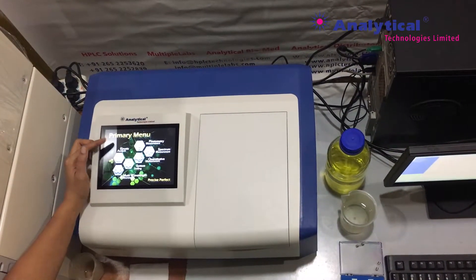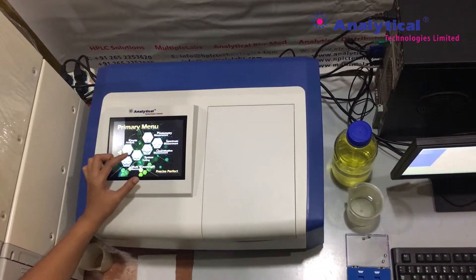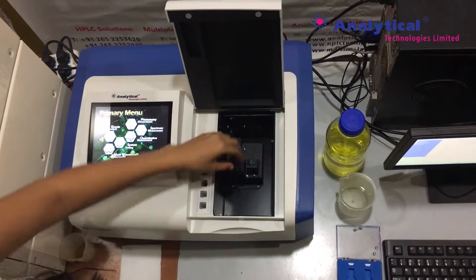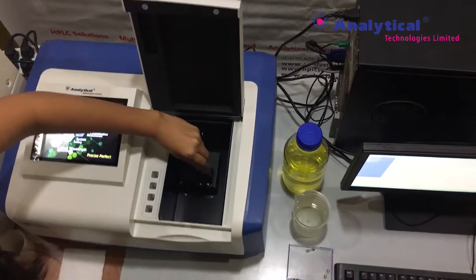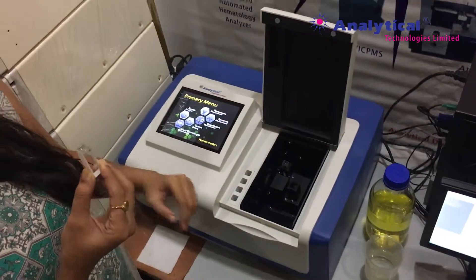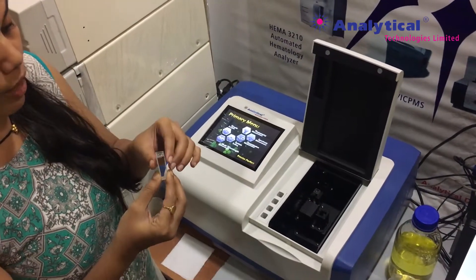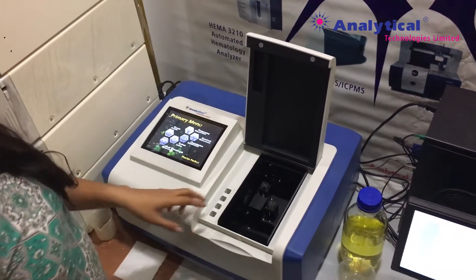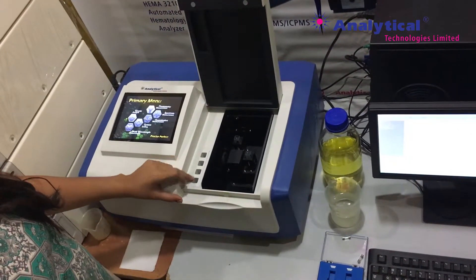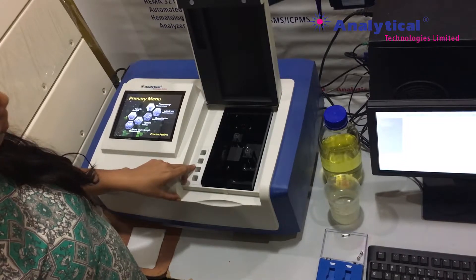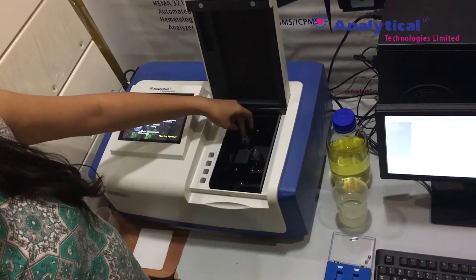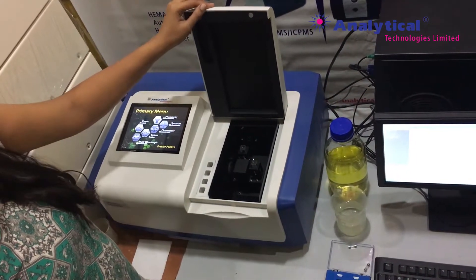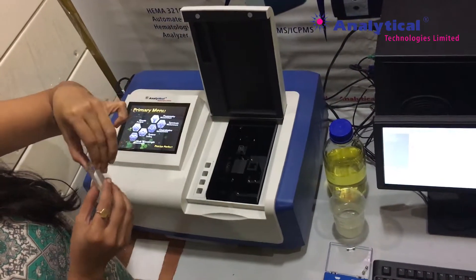For quantitative analysis, you need to go with quantitative measurement and multi-wavelength measurement for calibration. Here we can see the place where the cuvette needs to be placed. This is the second part of the system known as the cuvette. It can be made up of quartz, glass, or disposable material for regular routine use. Two cuvette ports are available for analysis and four cuvette ports are available as extra ports. One port is for the standard and the other is for the sample, and in the beginning you keep both as distilled water as a reference.